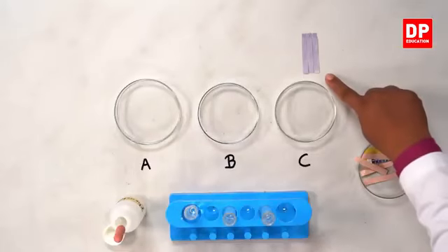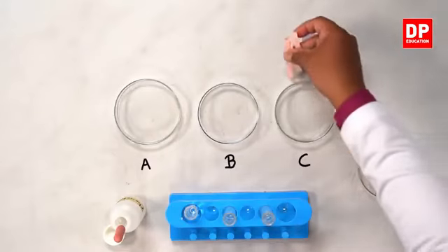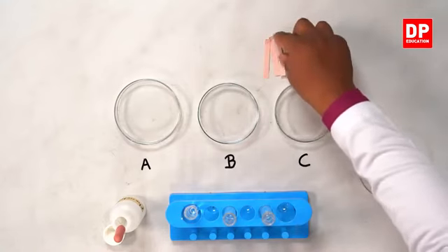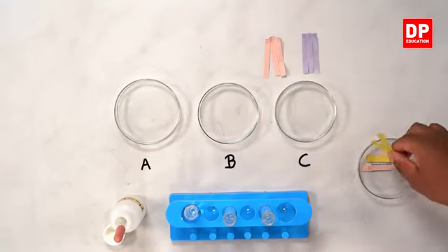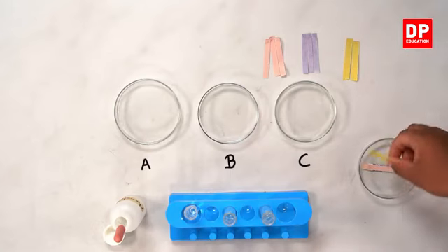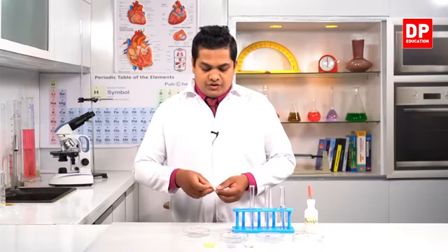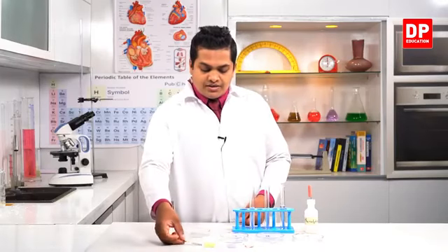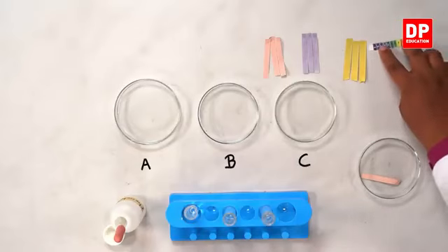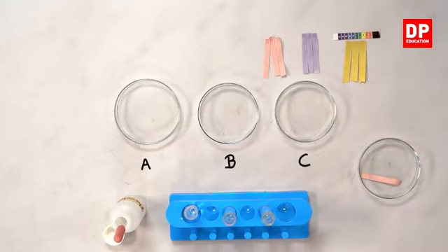So blue litmus, then these red color paper strips are red litmus. Then these yellow color paper strips are pH papers. And to identify the pH scale and the relevant color, we have an indicator with the relevant colors.